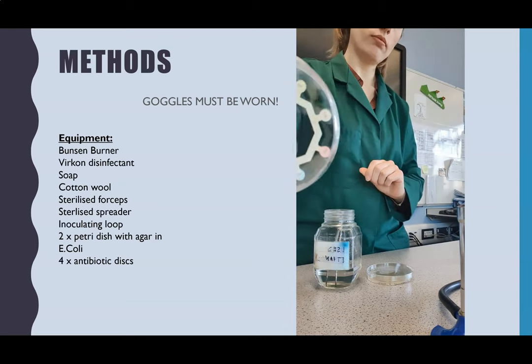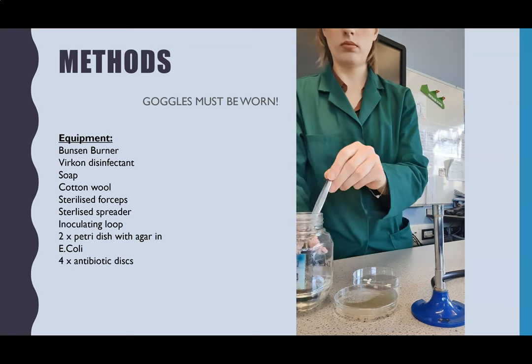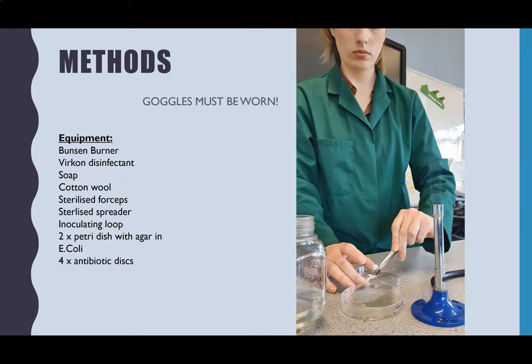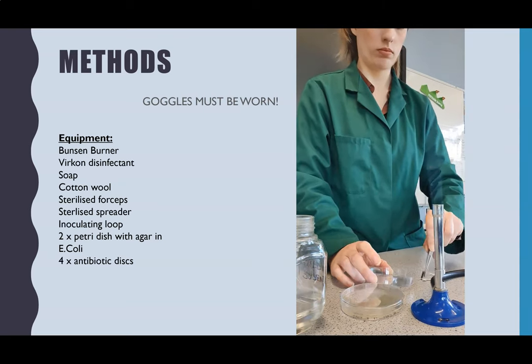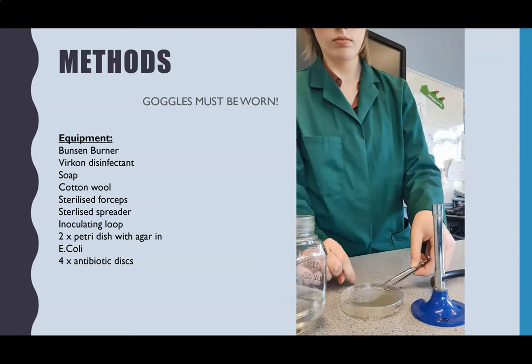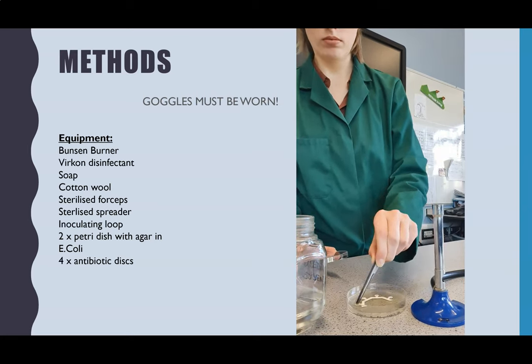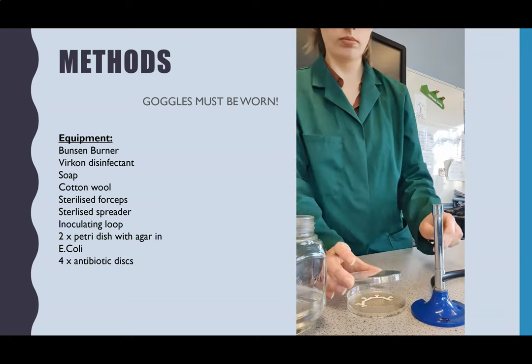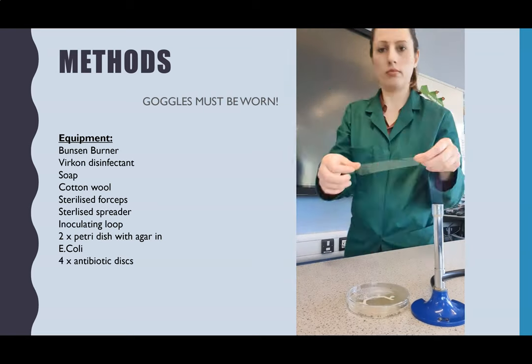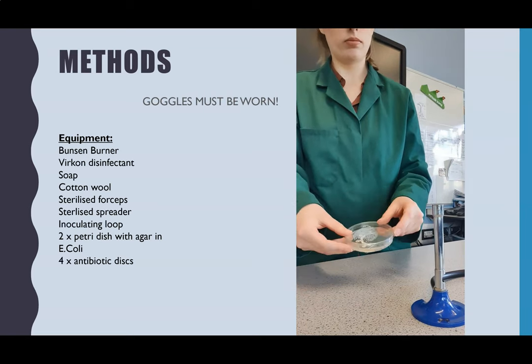Then straight into the Vercon to disinfect the spreader. Next, I've got my sterile forceps and four antibiotic discs — I'll use the sterile forceps to pick up the discs and place them onto the Petri dish. If you drop one, you should really get another, but the reason I carried on was that I was confident my workspace was completely sterile as I had just sterilised the work surface. I've made sure each disc is completely flat, then taped the lid on again — that's my second plate done.